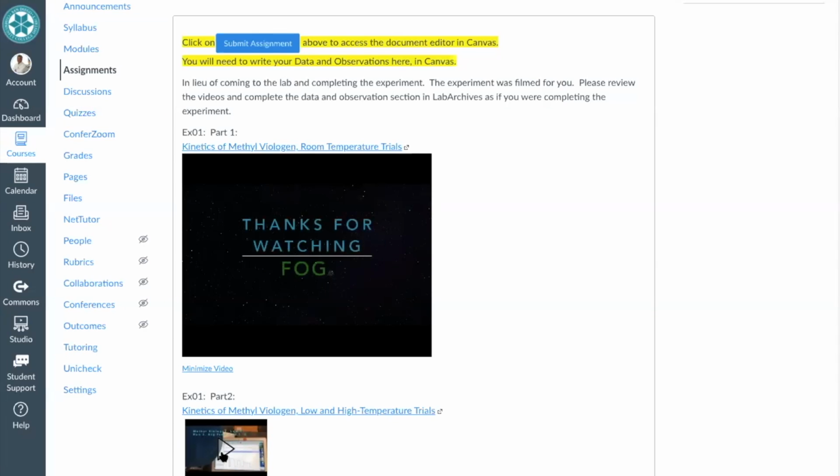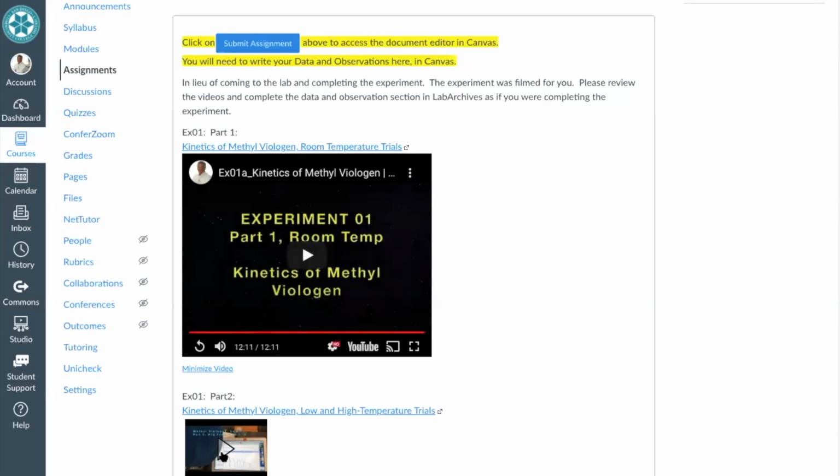Why is this important? Because you need to maintain the temperature of your solution. The problem is that, let's say you take your cuvette, and at room temperature it's 25 degrees or 20 degrees, and you want to run the experiment at, say, 16 degrees, a little bit cooler than your 20 degrees, 4 degrees cooler. So in order to lower that temperature, you need to put it in a cold water bath or some ice, and not so much ice, because then it'll really drop the temperature. And the lower the temperature, the slower the reaction.